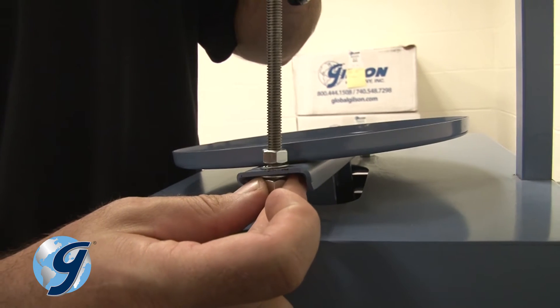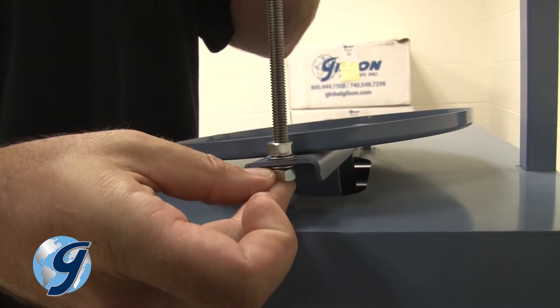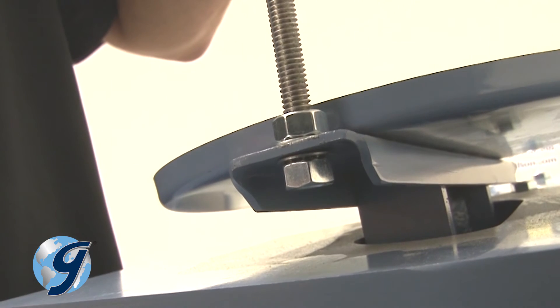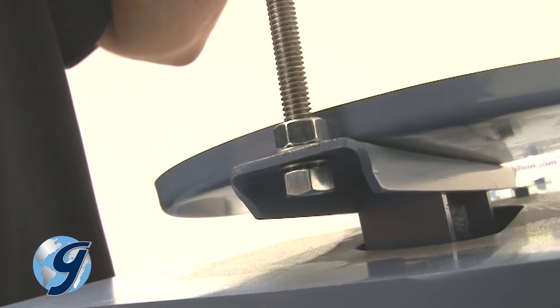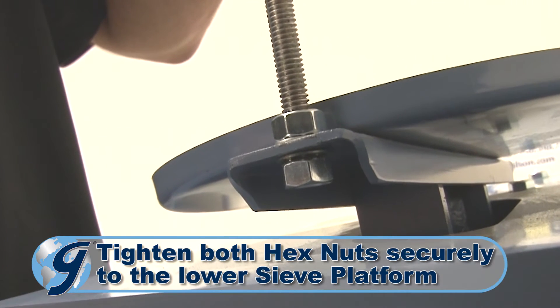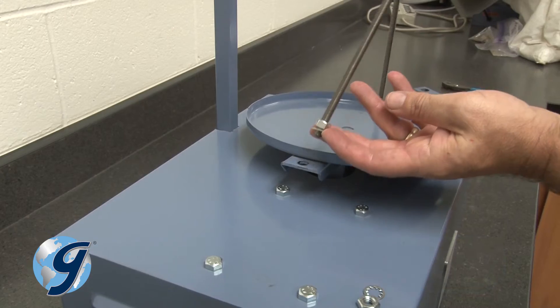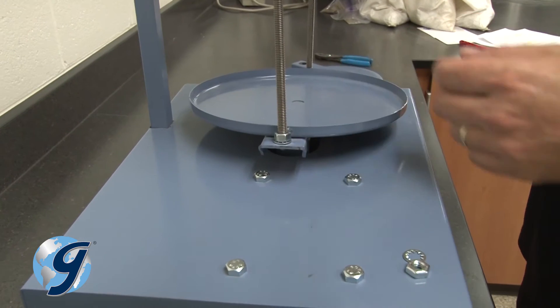Now, on the underside of the lower sieve platform, place a hex nut and lock washer onto the sieve retaining rod. Tighten both hex nuts securely to the lower sieve platform. Repeat for the other sieve retaining rod.